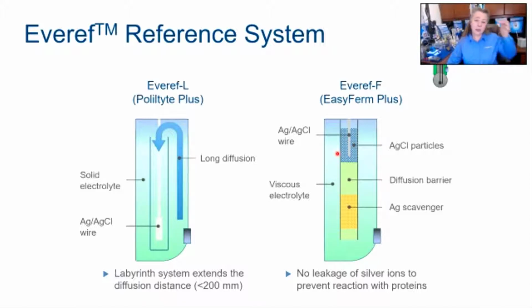And you can see this from the outside. If you start seeing little specks of black showing up in your silver scavenger layer, it actually tells you that your probe might be getting towards an end of life, because these are consumable probes.